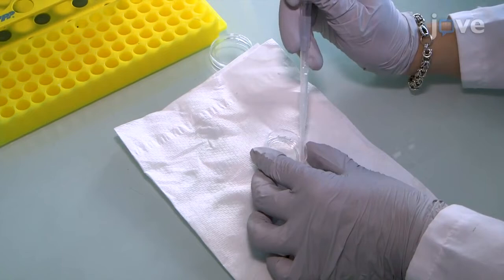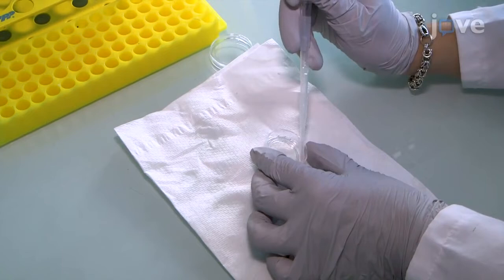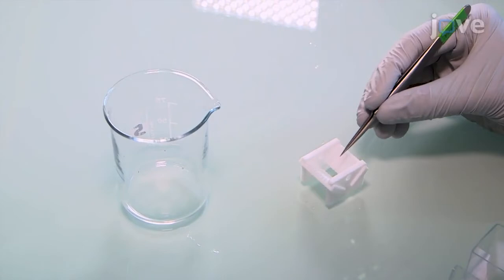To prepare the cover slips for flattening the gel, put them into a ceramic cover slip holder, put the holder in a small beaker, and pour siliconizing reagent over the cover slips, making sure to cover them completely.